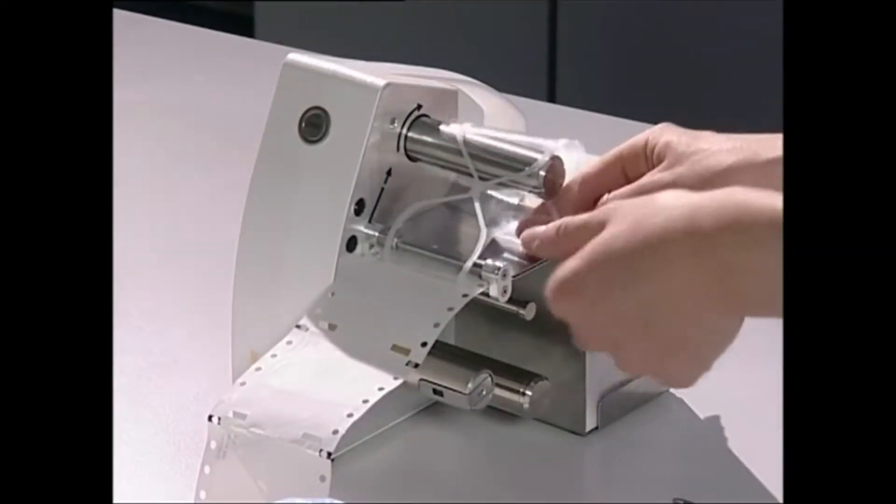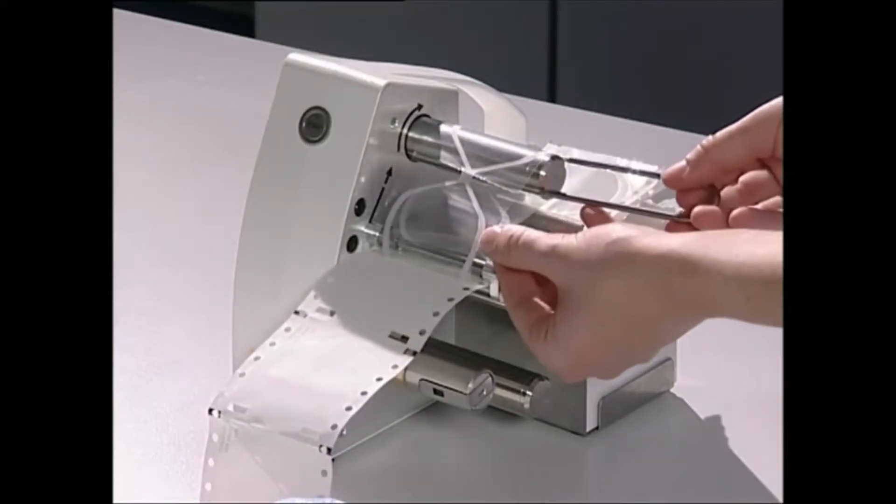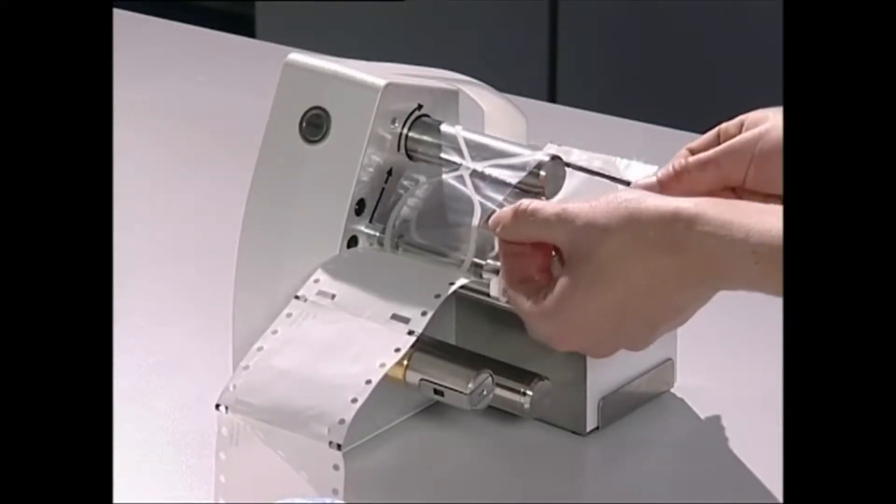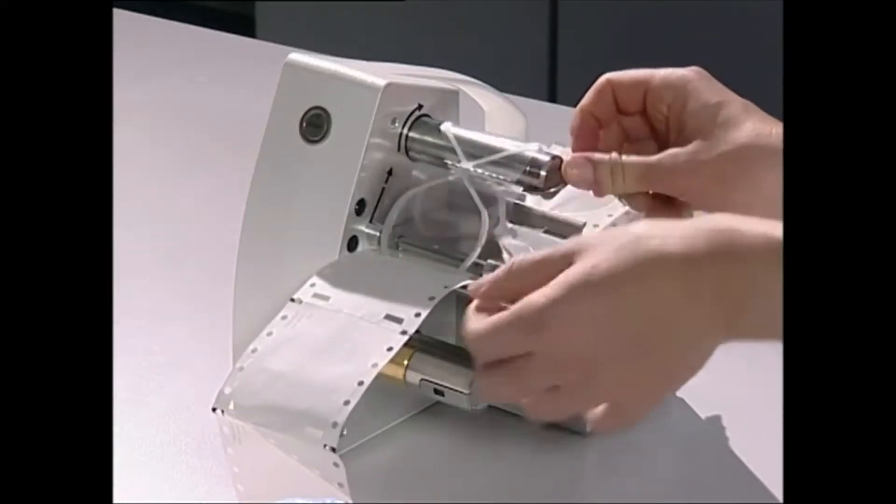Wrap the transparent film around the top winding roller so that it covers the two guide grooves. Push the holding clamp all the way into the guide grooves of the top winding roller.